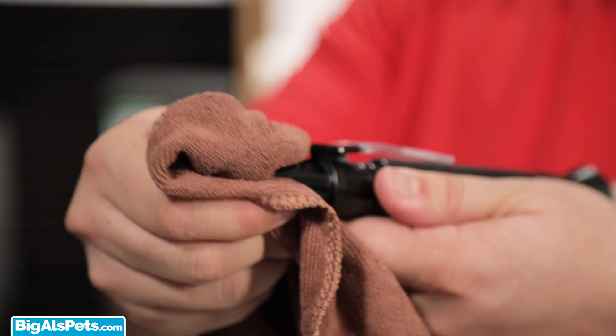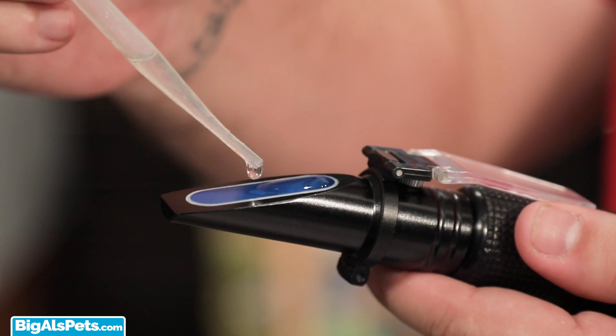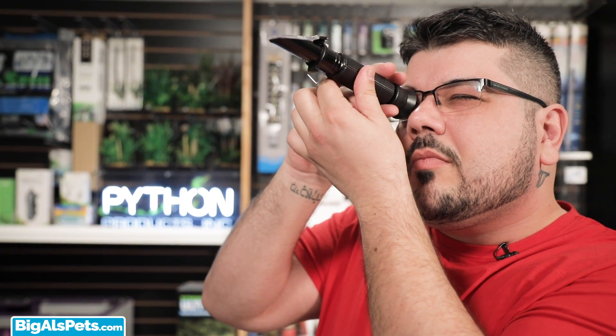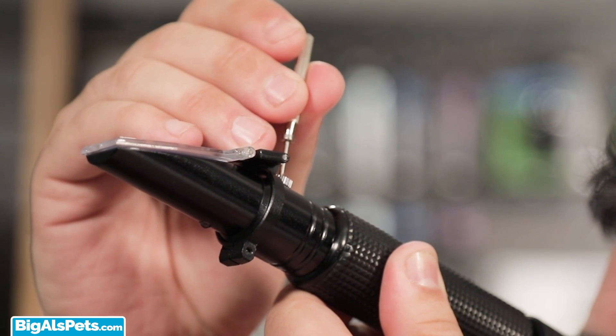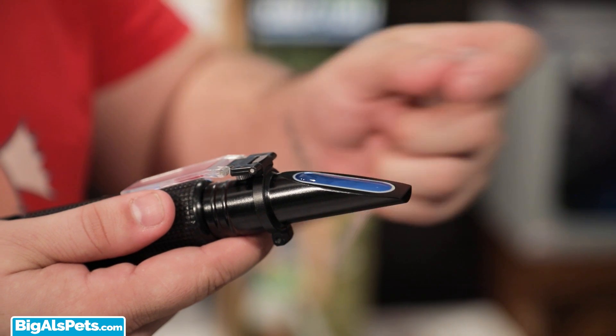We wipe the prism and add a sample of accuracy solution using our pipette. We add drops to the refractometer and look through it. At this point, we need to check that the line where the blue and white meet is at 35 PPT. If the line is not at 35 PPT, use a screwdriver to adjust. Now we know our refractometer is calibrated and we can check our aquarium sample to find out what our salinity is.